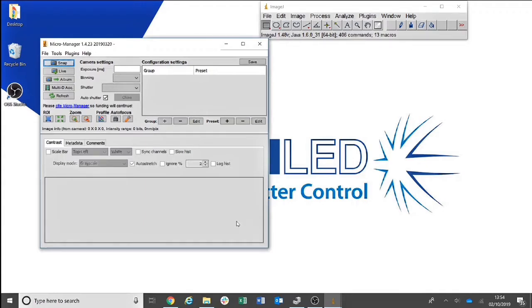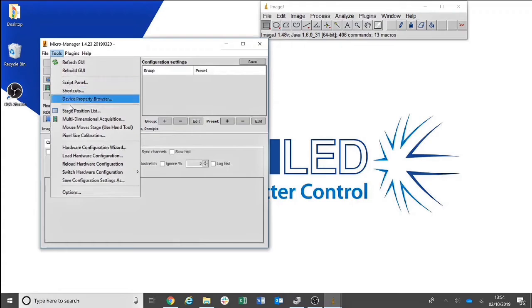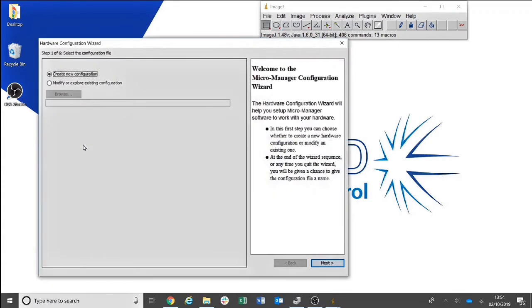To begin installing your light source, you will then need to head over to Tools and Hardware Configuration Wizard. Select Create a new file and head to Step 2.